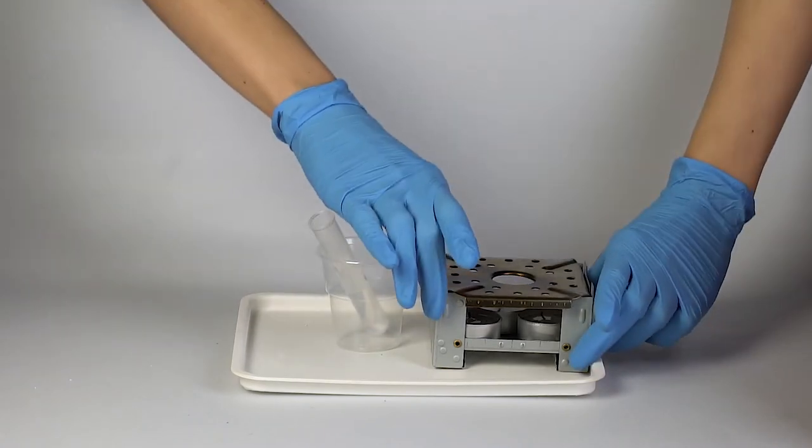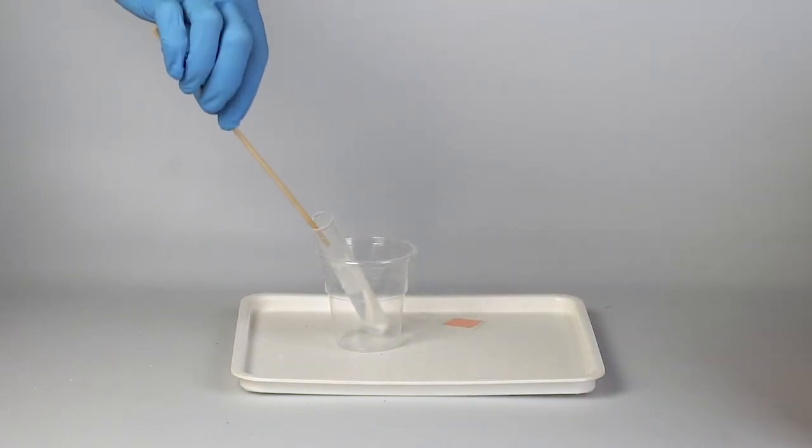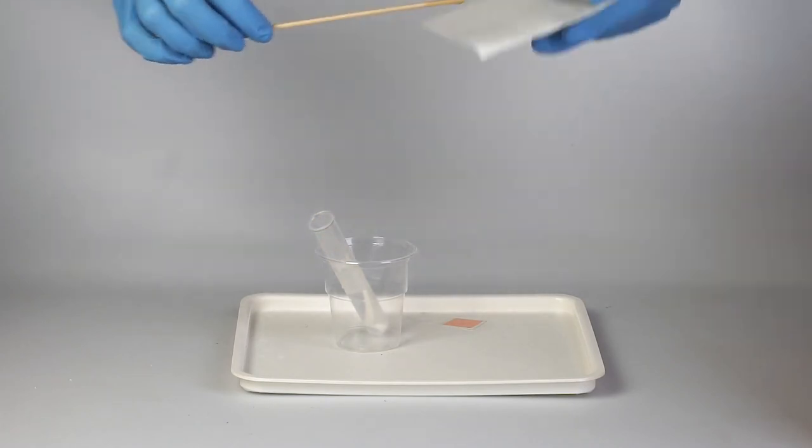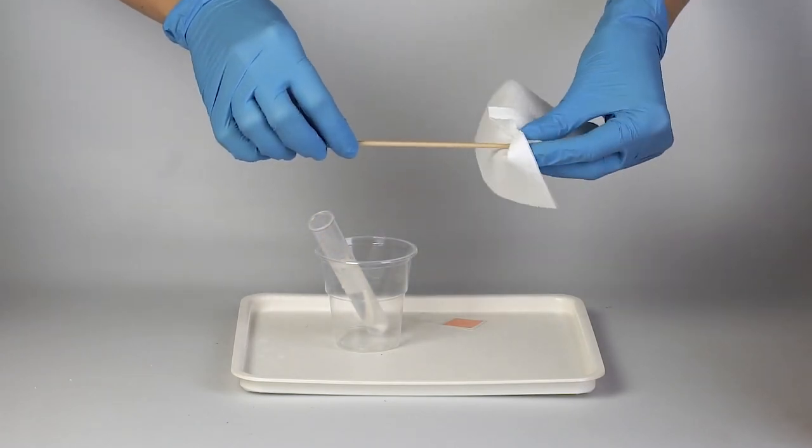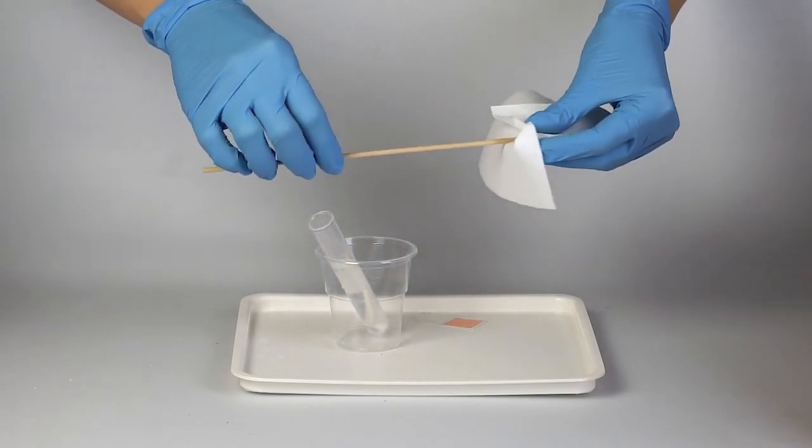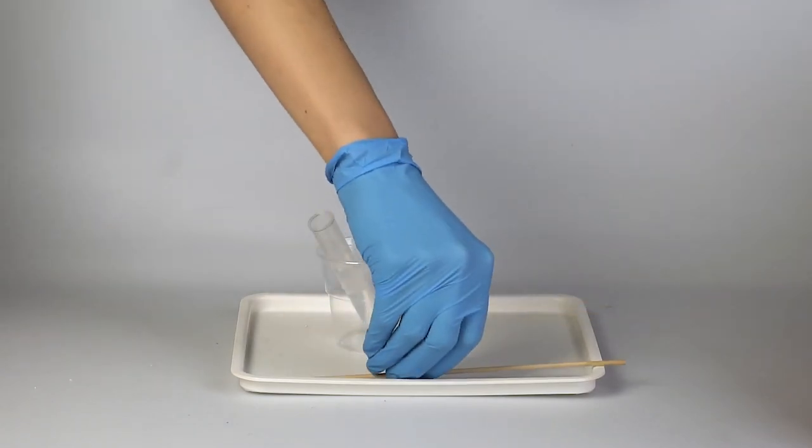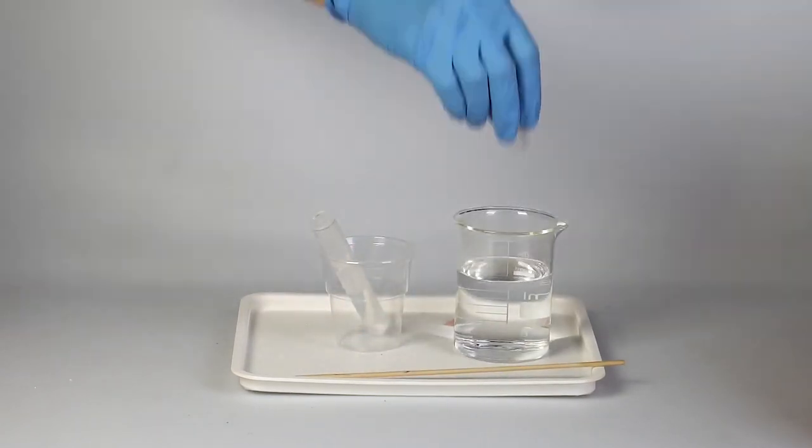Dip the tip of the splint into the solution in the test tube. Lightly pat the tip with a paper towel and put it aside. Wet the rubber stopper with water and close the test tube. Wait 15 minutes.